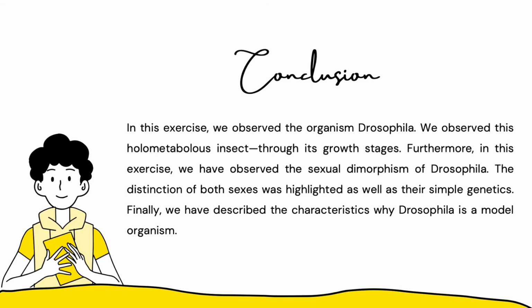Finally, Drosophila has been widely studied because it is easy to maintain and breed in a laboratory. Additionally, they are easy to study because their genetics are simple in comparison to mammals. This makes Drosophila a model organism and makes it perfect for activities such as this exercise.